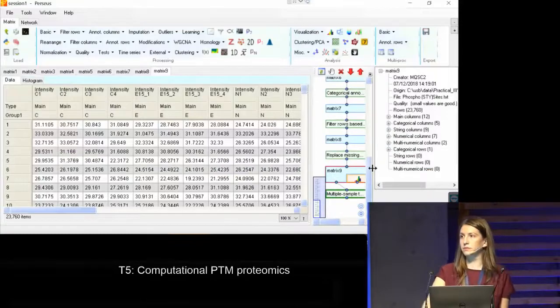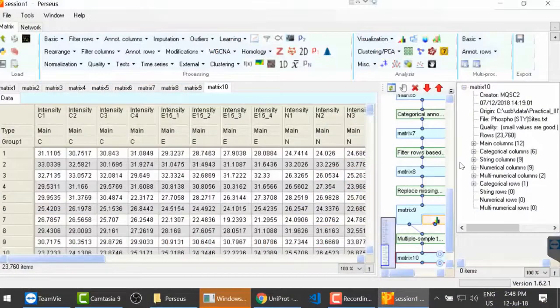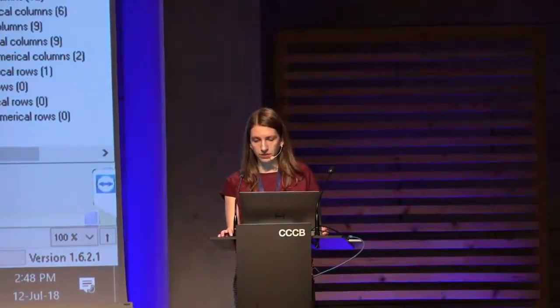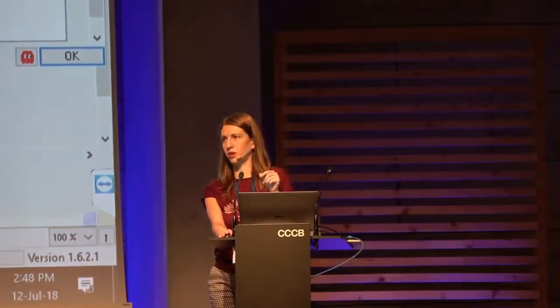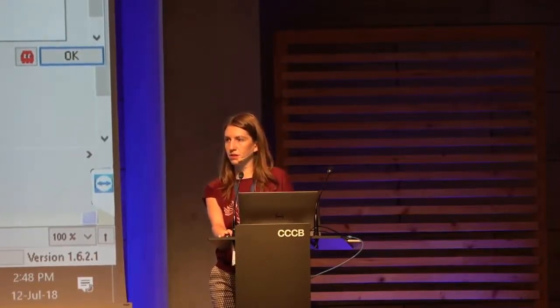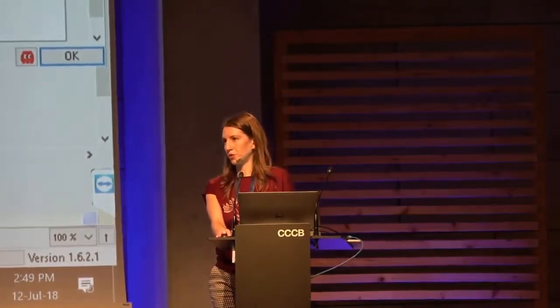Hello. So if I have a bimodal distribution, should I adjust a parameter to make everything normally distributed, or should I just simply happily accept those? Correct. Because we have these empirical values for the downshift and the width, or I can just open it here. If you see that you create really a second distribution, then I would advise you to change this downshift. Then you would have to reduce it to make sure that you remain within the main distribution. But now you do have some of them looking like a bimodal distribution. Is that okay? In this case, it's acceptable because it was just 1 or 2 samples, yes.